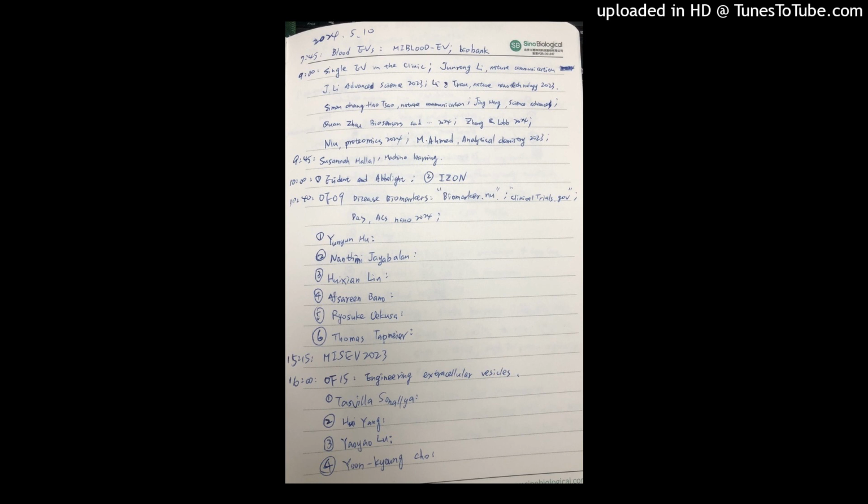Exactly. You're saying the difference, yeah? So I'm sorry to say that the cfDNA and EVDNA, they are completely different. So maybe the reason why you find cfDNA in your EV preparation is because of ultracentrifugation, where you get EVDNA as well as cfDNA in your preparation. I'm coming from University Hospital in Germany, and we have a paper which got published 2 years before, and we use size exclusion chromatography, and in that you get EVDNA in different fractions and cell-free DNA in different fractions.